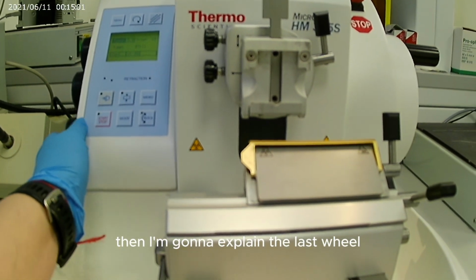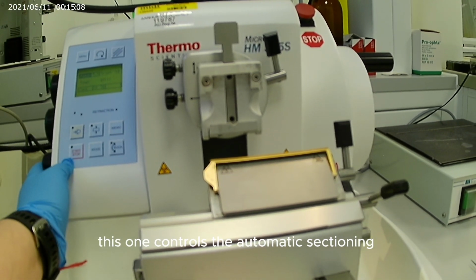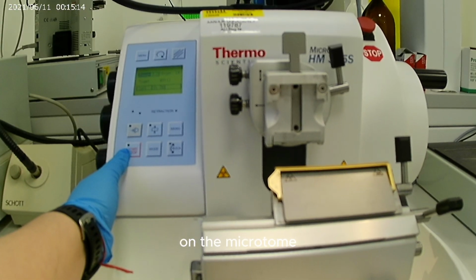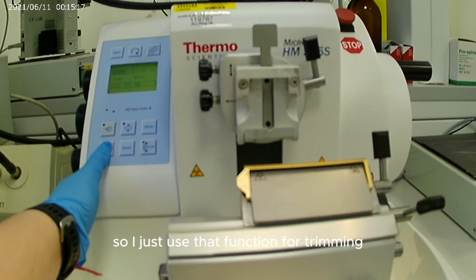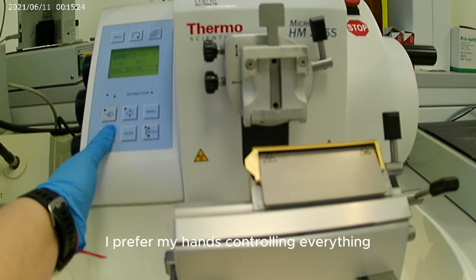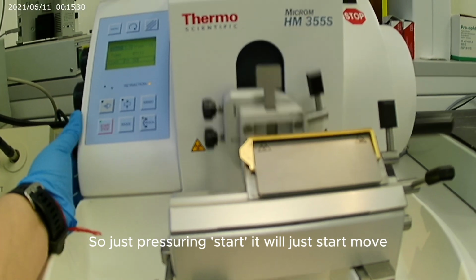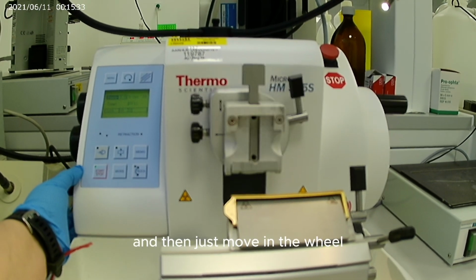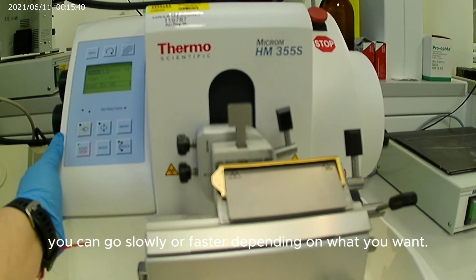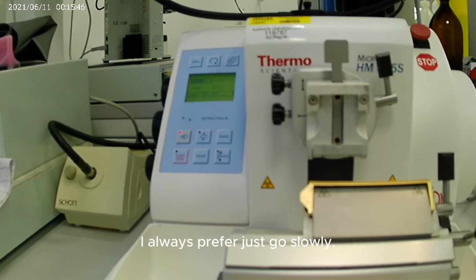Then I'm going to explain the last wheel. This one controls the automatic sectioning on the microtome. I only use that function for trimming, never for cutting. I prefer my hands controlling everything while I'm cutting and taking the sections. Just pressing start, it will start to move. And then by moving the wheel, you can change the speed. You can go slowly or faster depending on what you want. I always prefer to go slowly.